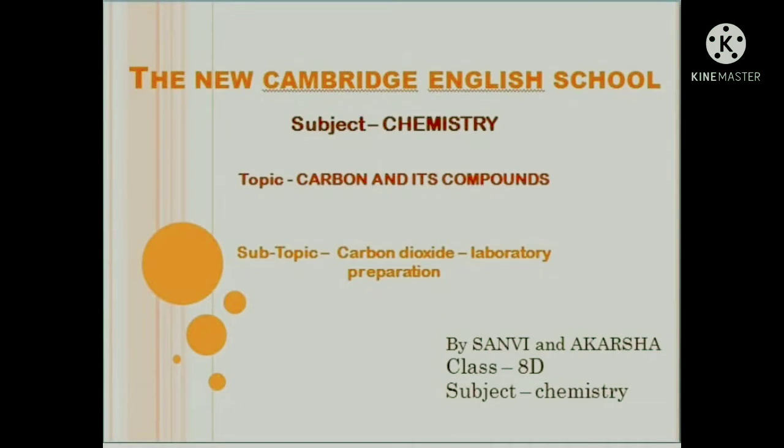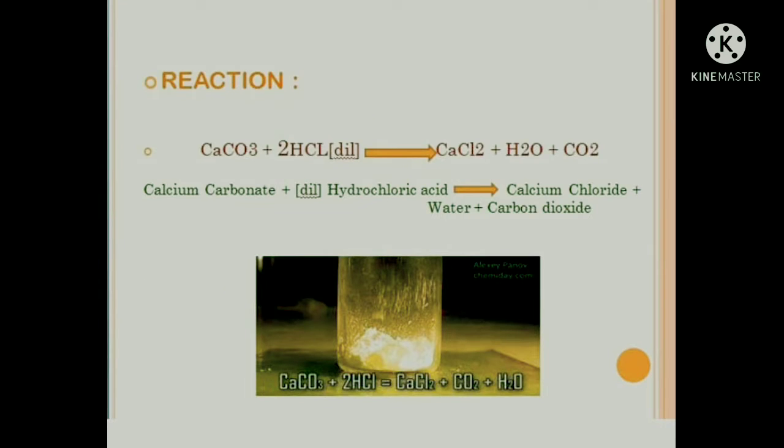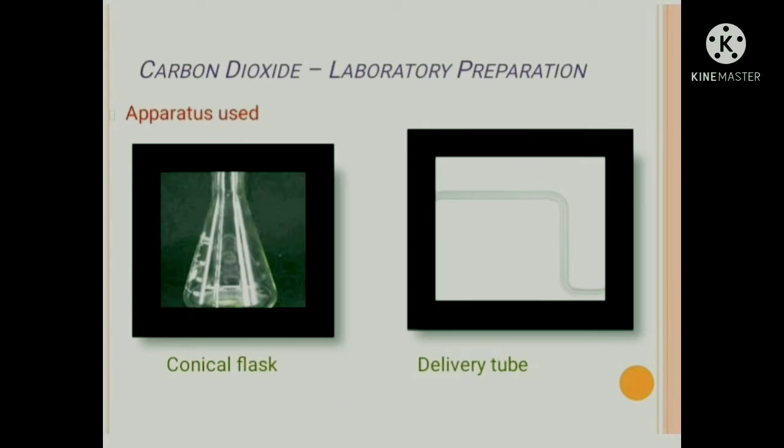The topic for our presentation is carbon and its compounds. The subtopic in it is carbon dioxide laboratory preparation. Now I am going to say the reaction for it. Calcium carbonate plus dilute hydrochloric acid, which gives calcium chloride plus water plus carbon dioxide.